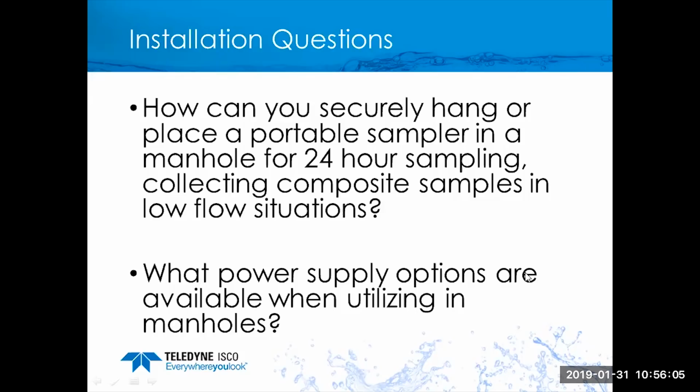There was a question from the audience that said, should you ever turn the liquid detector sensor off? The answer to that is absolutely. If you're in an application condition that's going to work contrary to that liquid detector, i.e. applications that have a high degree of entrained air in the sample, applications where you have a fairly significant vertical lift, 23, 24, 25 feet, applications where you may have a high degree of viscosity in the sample that's being collected.